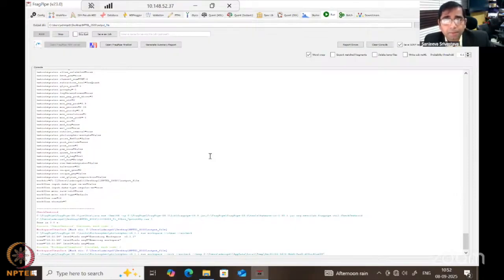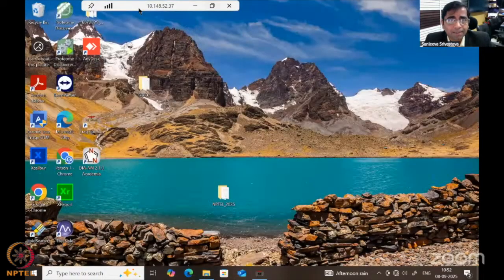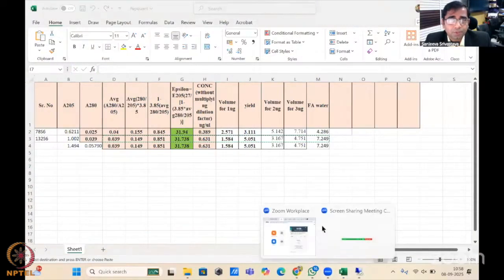Another software which we will now show is Mascot from Matrix Science, which Ankit will briefly walk you through. If you have a very simple mixture of proteins and want to identify their sequences and find the top hit, he will show how to do that using Mascot analysis. So you'll do that, Ankit.